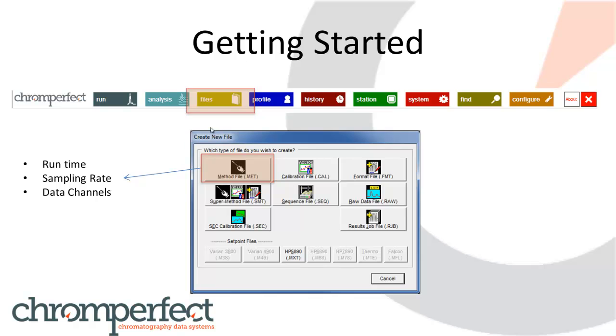However, to get started there are only three components which we must configure accurately. It is these three elements which will ensure the data is collected correctly, and so we will not need to rerun our sample. The runtime, the sampling rate. The last thing we need to configure correctly is which channels of data Chromperfect will collect the data from. For many customers with single-channel instruments, they never need to consider anything other than channel A. For multiple detector instruments we may be collecting from channel A, channel B or both.